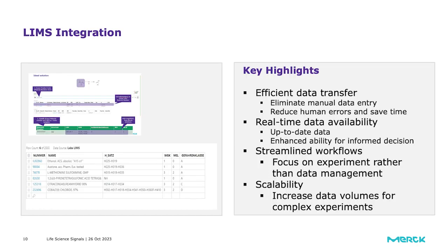You will see that these are the needs and what information is your part. We have a use case in Signals where, for raw materials, we need compliance, regulatory, and safety information. Rather than entering that information manually, when it is already available in the LIMS system, we connect these two systems.